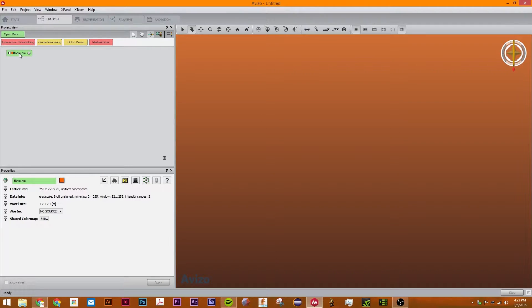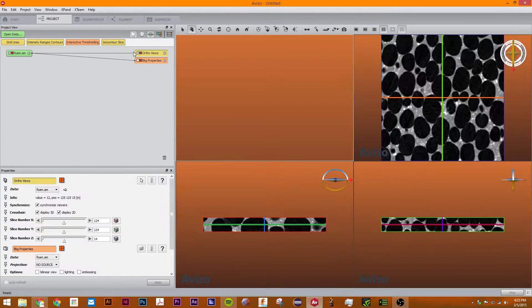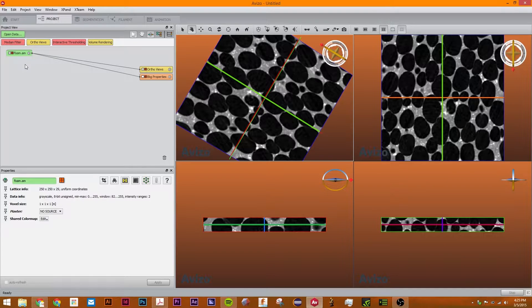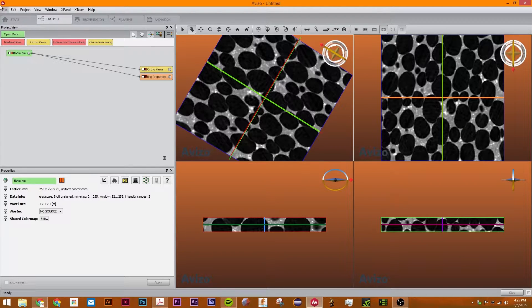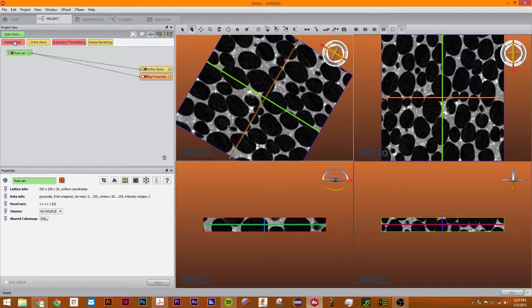First thing we're going to do is attach ortho views to this. I don't really like these white spots so what I'm going to do to get rid of them is use the median filter. The median filter is commonly used to process images and to take the noise out and smooth them out.